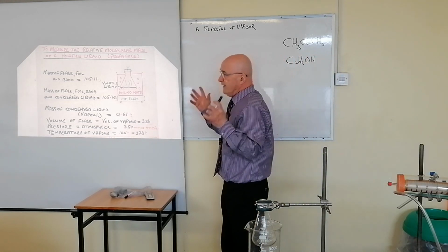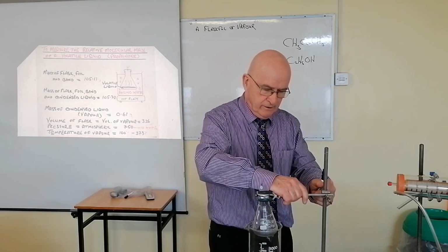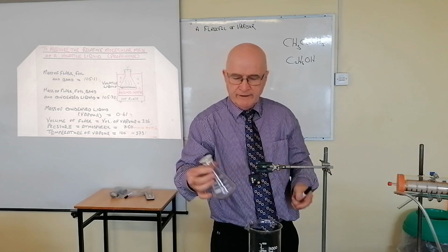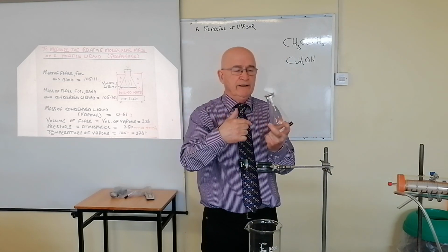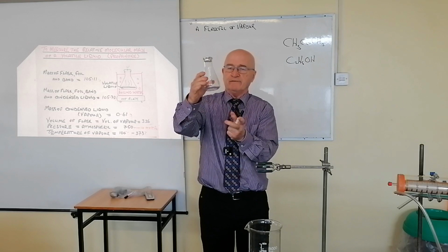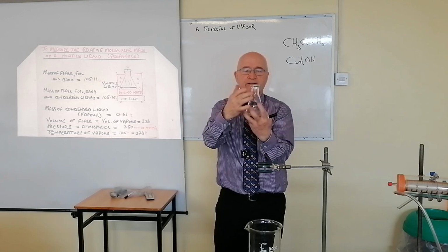So here's what you do then, basically. You take this flask. I think I can just take it off for the moment, and I'll go back later with it. I have the flask on a clamp here for a particular reason. You take this flask, and you prepare it for the experiment. It's a regular conical flask. I have put tin foil on it and I have elastic band around it, and I have a tiny pinhole on the surface of that. Okay, so that's what you have. That's an empty container, glass flask, elastic band, and I have the tin foil around it.